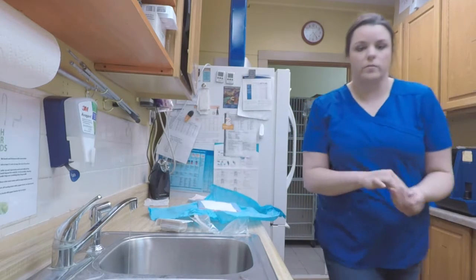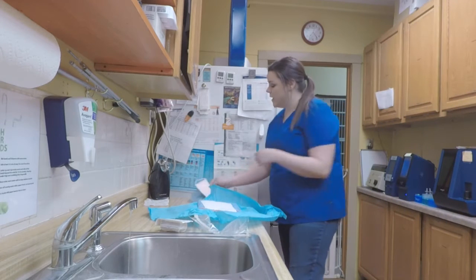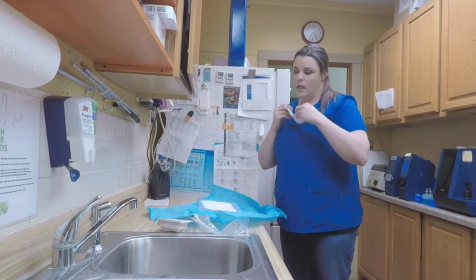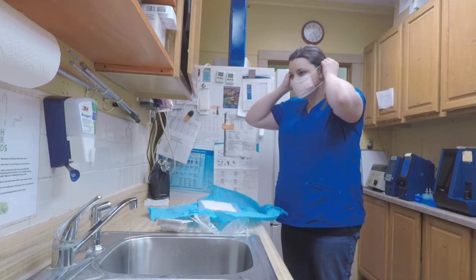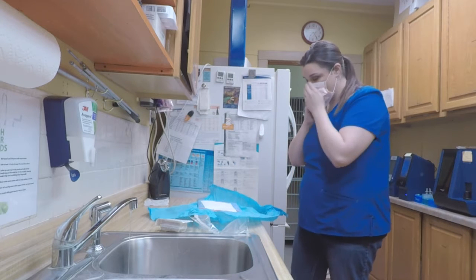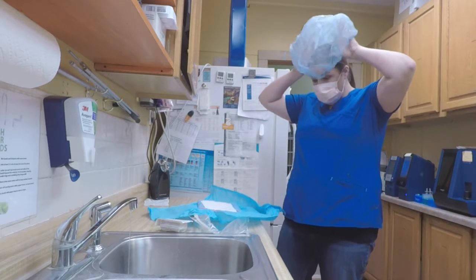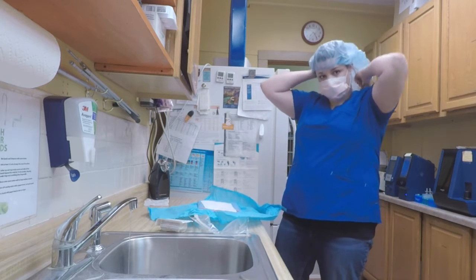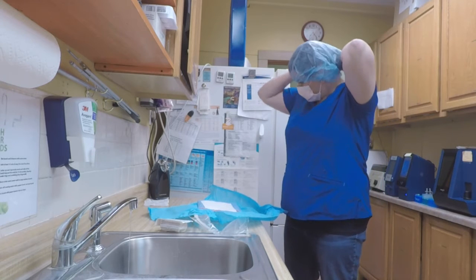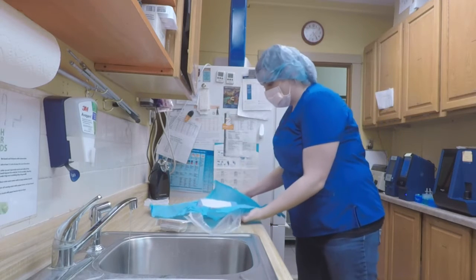You're going to make sure all your jewelry's off. And then you're going to put on your face mask and your hairnet first. You want to make sure all of your hair is tucked in.